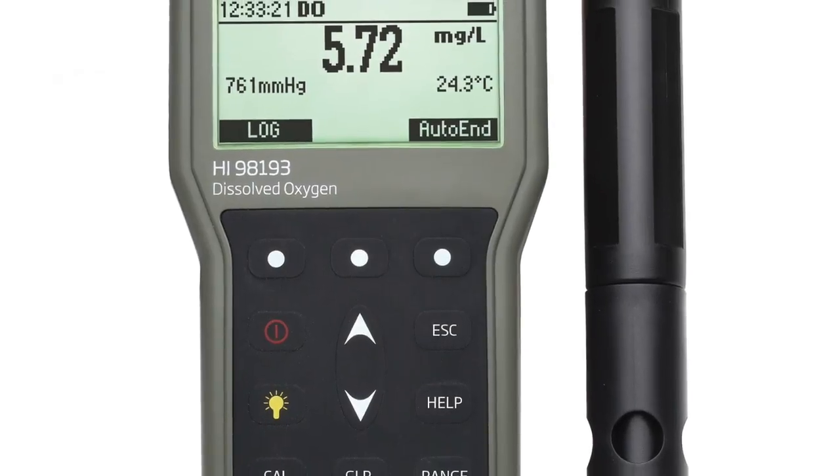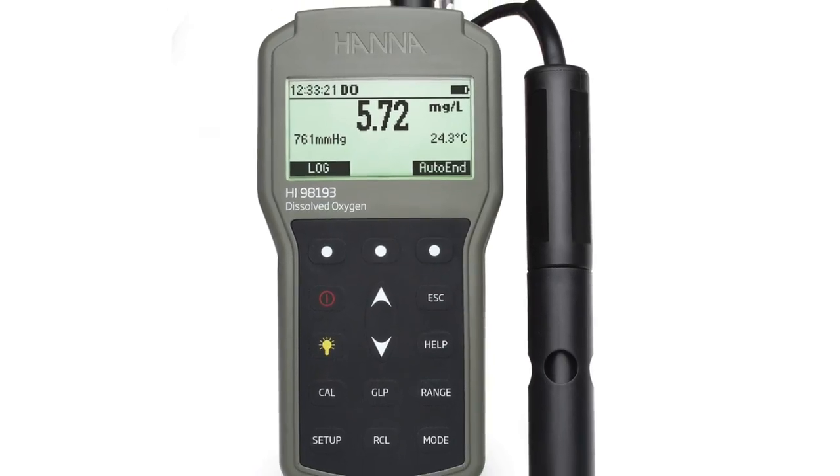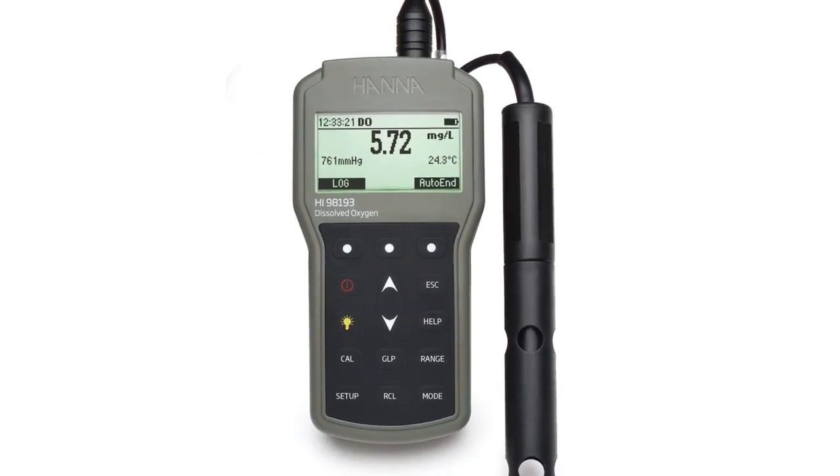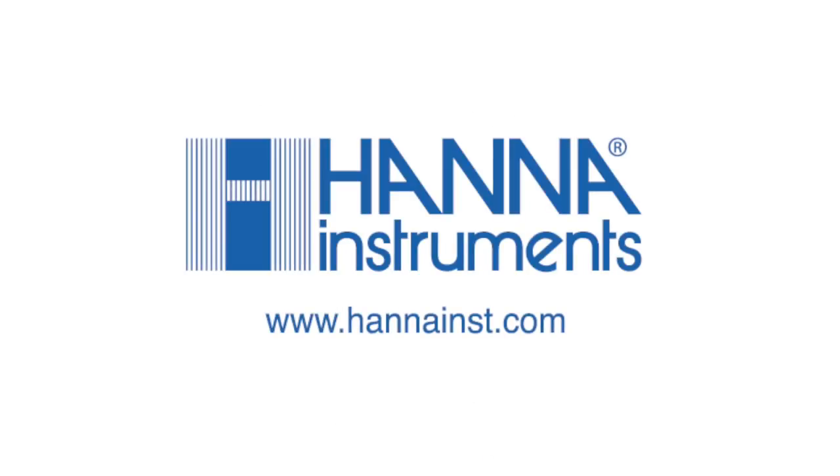The HI-98193 is an excellent choice for the customer who is looking for a rugged, waterproof meter that encompasses the features of benchtop instrumentation with the convenience of a portable meter. For more information about this or any of our other products, please visit our website.